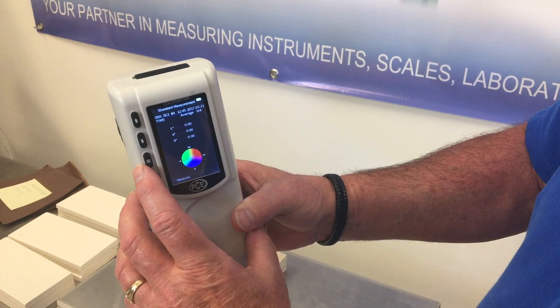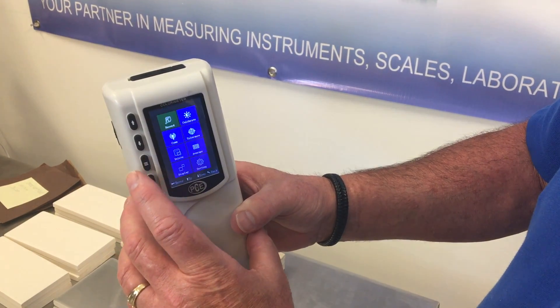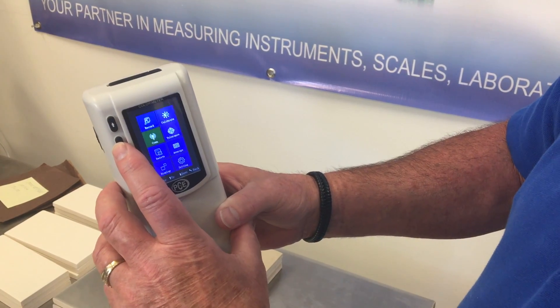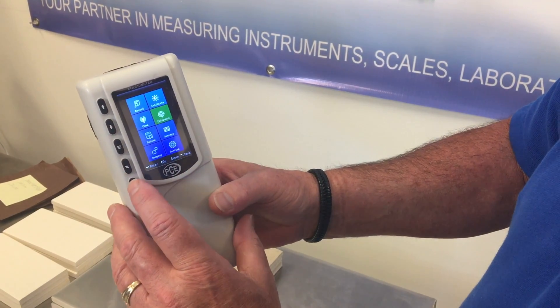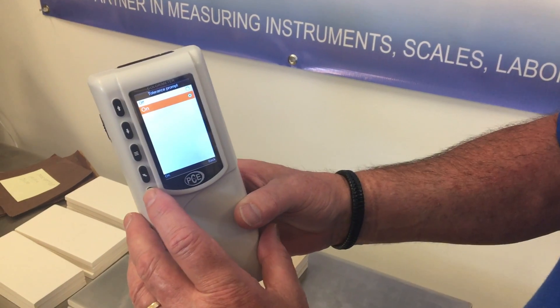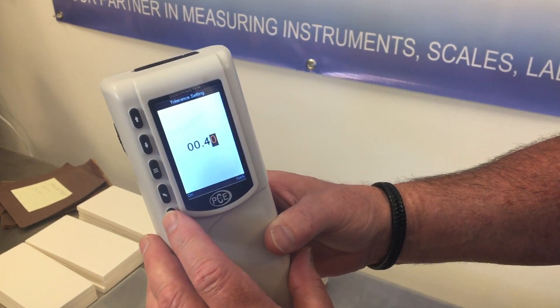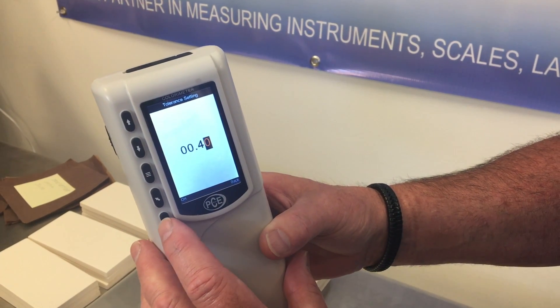Now we'll set the allowable tolerance. Go into the menu, go over to tolerance. Enter. On. Zero zero point four zero — that's good, that's where we want it. So we're going to leave it right there. Exit.